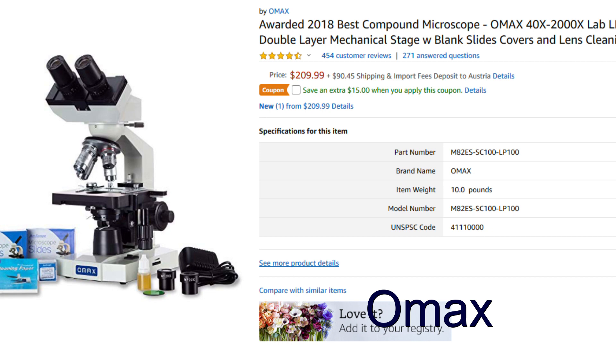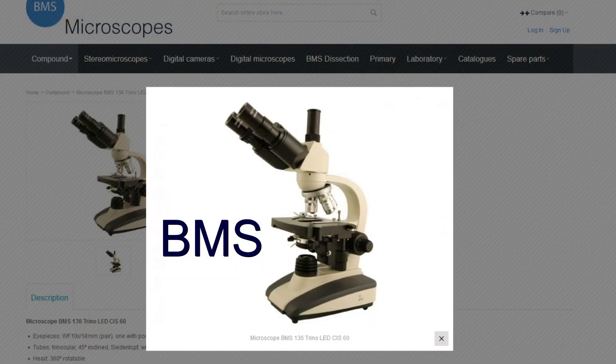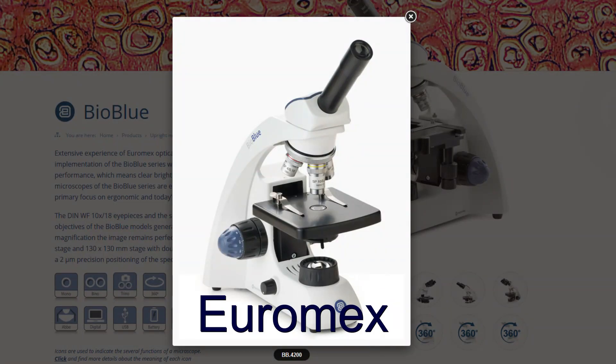I checked a couple of companies. I looked at Amscope, Swift, and Omax and I discovered that I found microscopes that basically all seem to use the same optics. And it's like this that I know these optics because also in school where we work we have a microscope that actually uses the same.